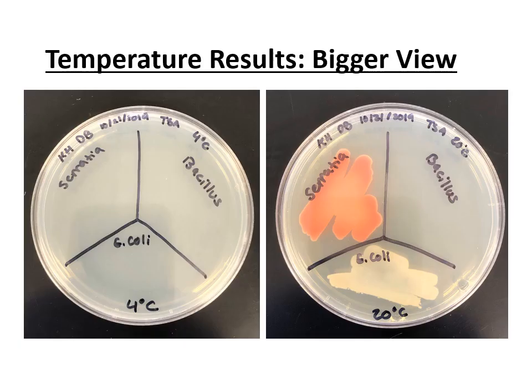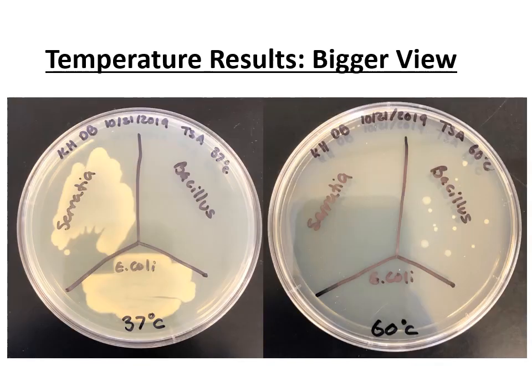Here I have the temperature results again. These are the same pictures from the previous slide, but I zoomed in so that you can better see each of the results. So here is the 4-degree and 20-degree result, and here is the 37 and 60-degree result.